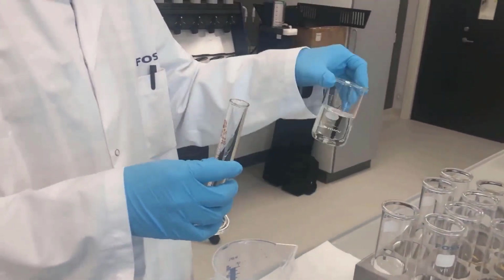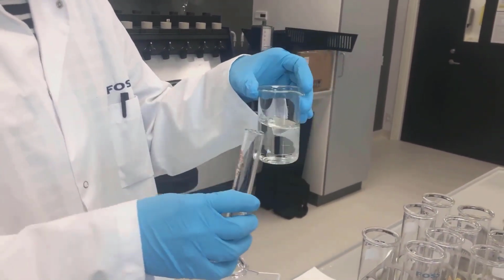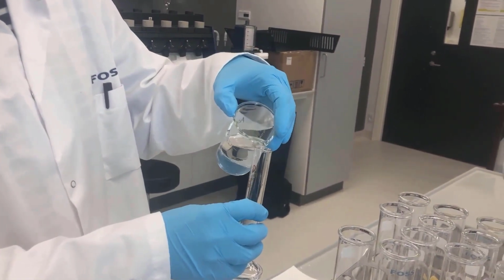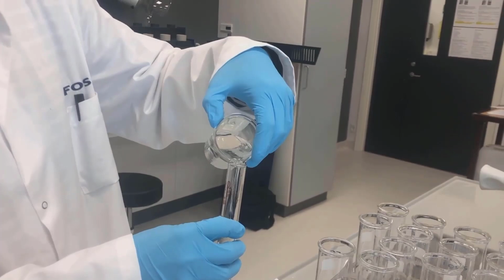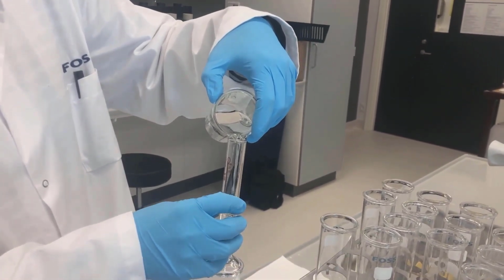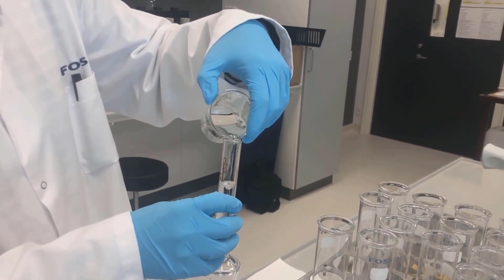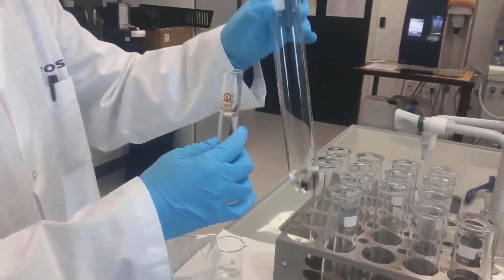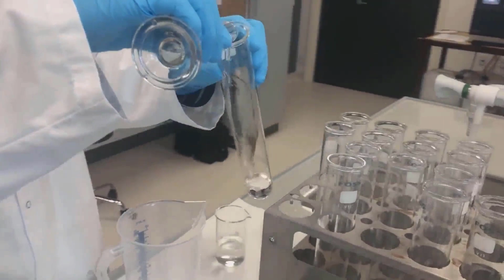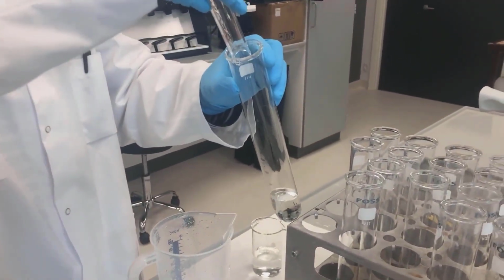Then measure 25 milliliters of citric acid and add it, so there will be a 50% citric acid solution.